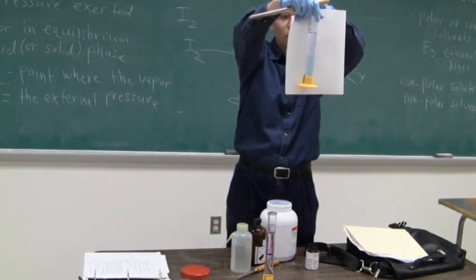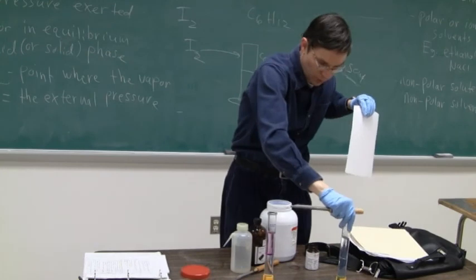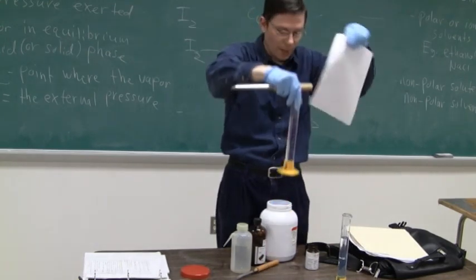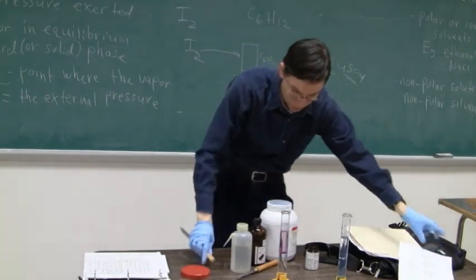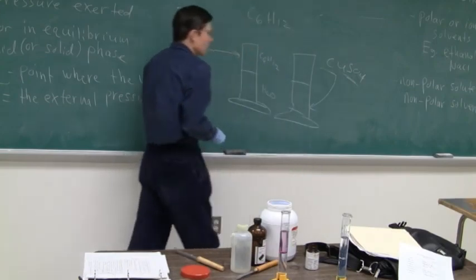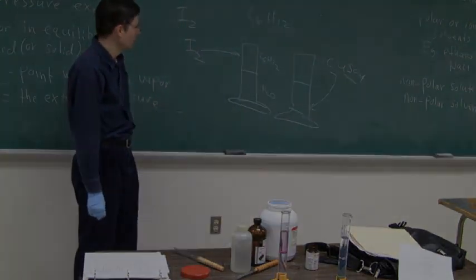So, there's our blue layer in the bottom where the water is. And, then, our pink layer at the top. So, again, it goes where it should. Again, the iodine is all on the side here. Copper sulfate down where the water should be.